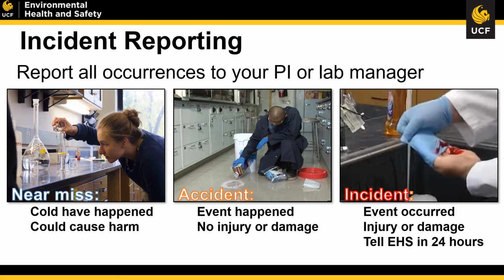The reason why the EHS department needs to know is because we will help you in your workplace safety practices to make sure that events like this don't happen and that you get proper medical care because you are a worker within a laboratory. So please, in the event a major incident occurs, fill out the proper documentation and let the Environmental Health and Safety Department know within 24 hours of that event occurring.